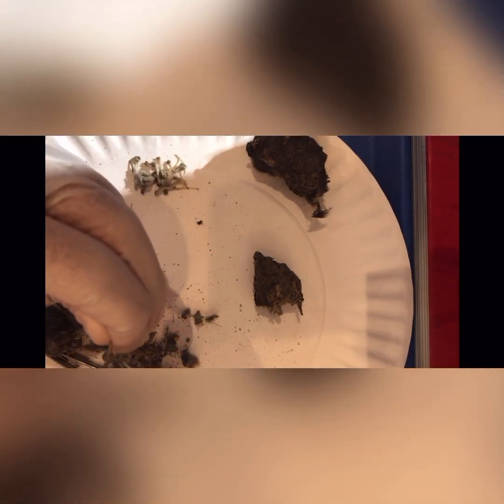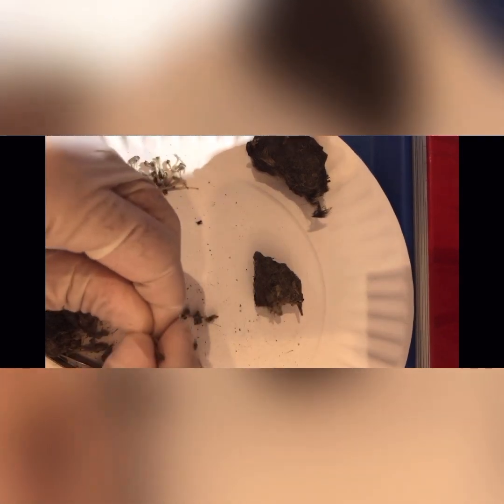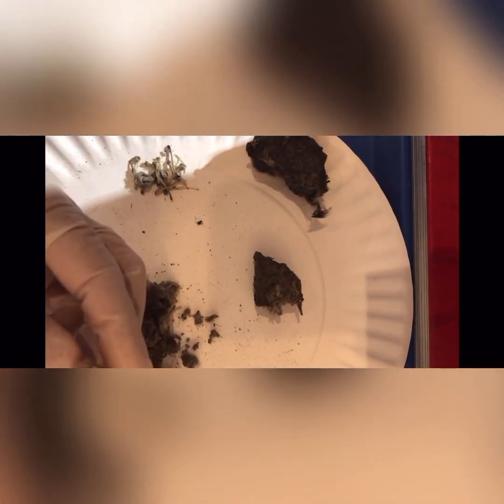But the regurgitation is actually the undigested fur, the bones, the teeth. So we might find some teeth in here. Lots and lots of good bones in here. We're gonna take them apart. Oh, and look what I just found.